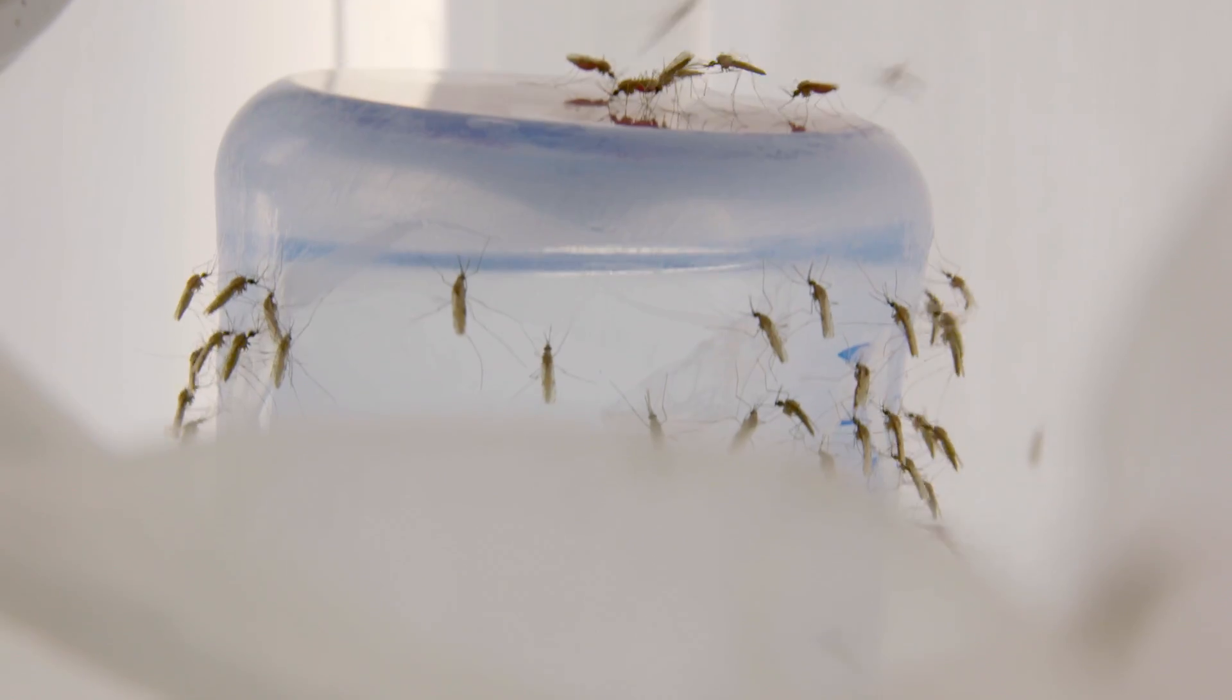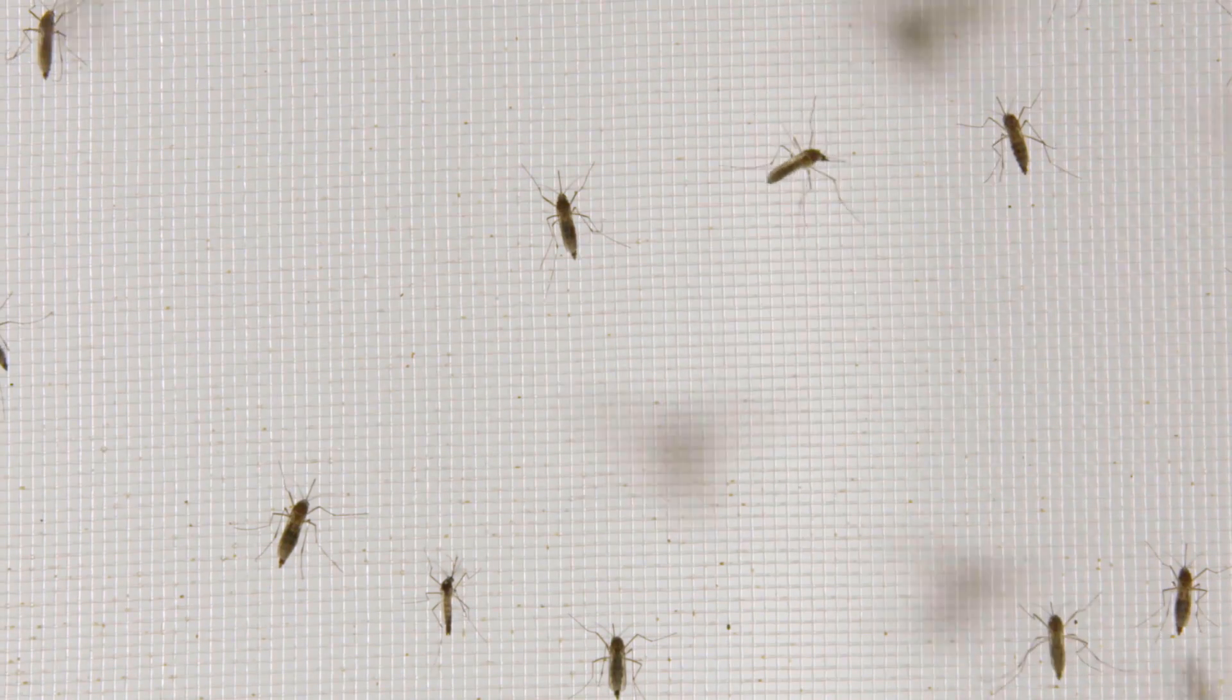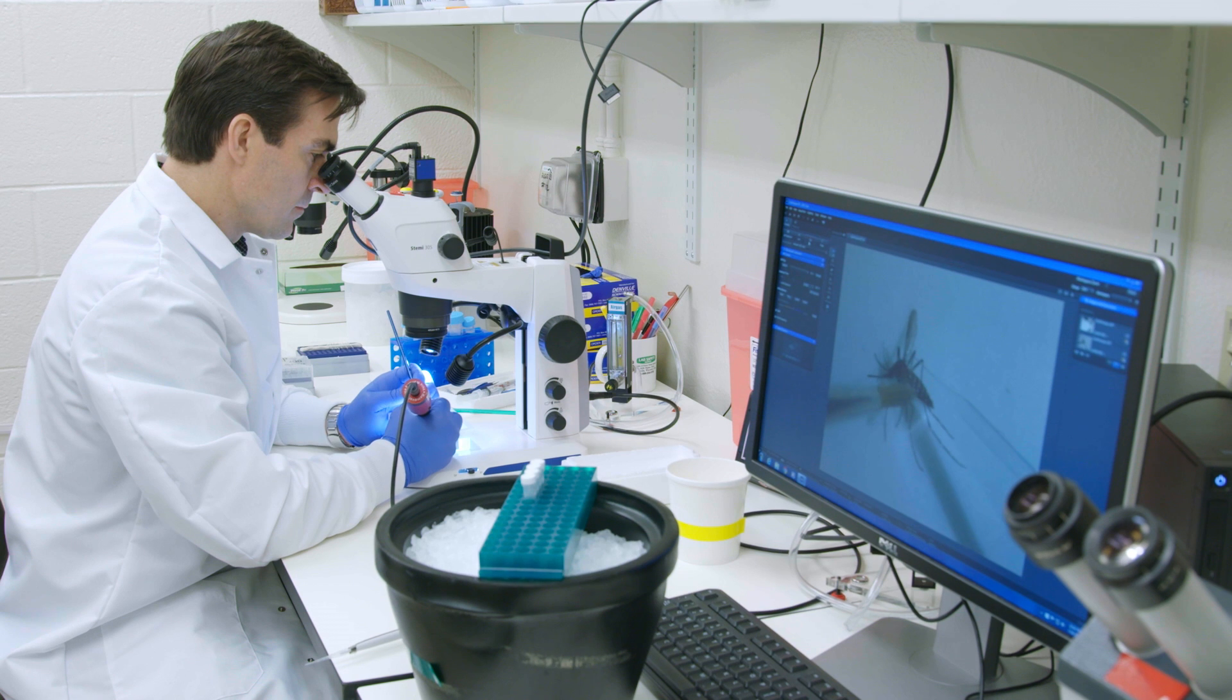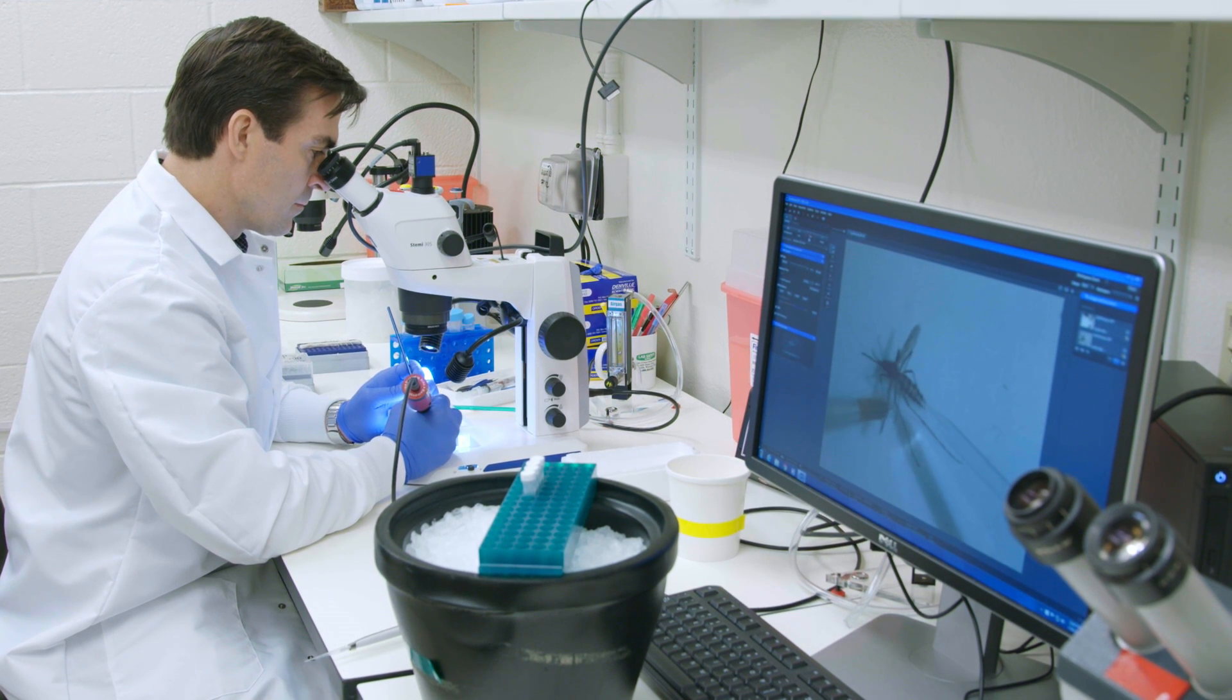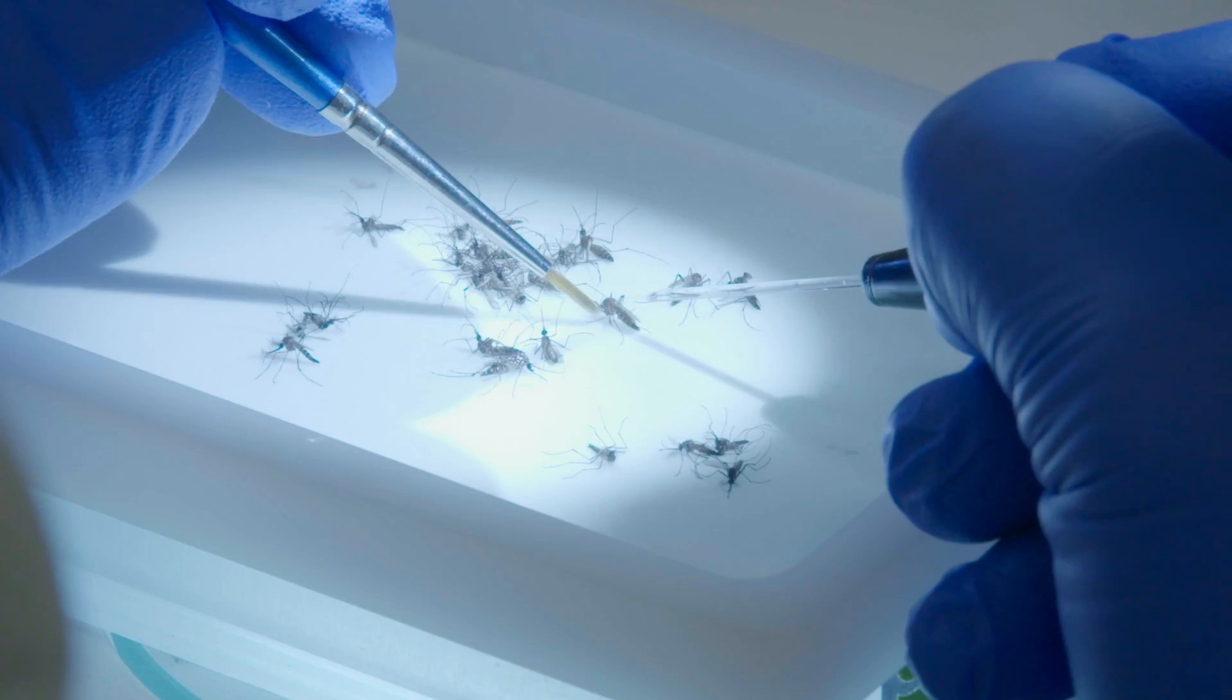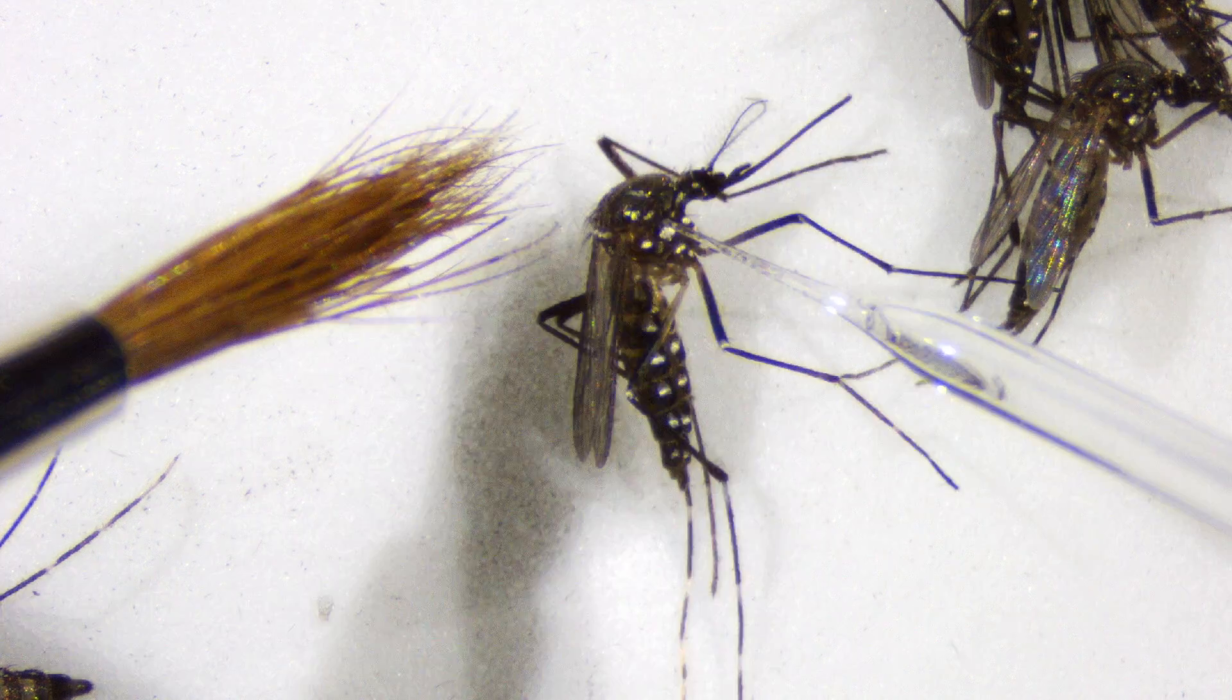My laboratory works with both malaria mosquitoes and the mosquitoes that transmit dengue and Zika virus. The main thing that we do in the lab is disable genes in the mosquito that we've identified through different screening methods, and then we challenge the mosquito with virus or with malaria parasites and see how these genes function and what role they play in defending the mosquito against these diseases.